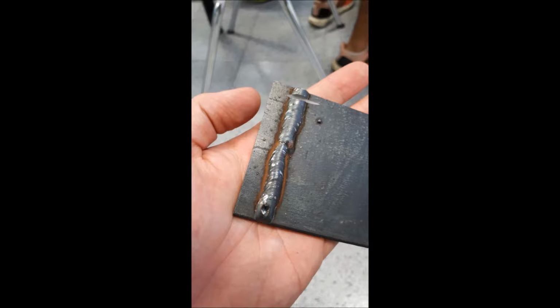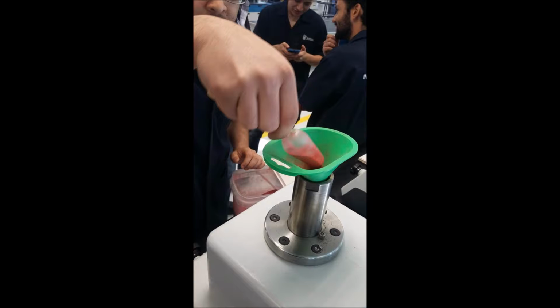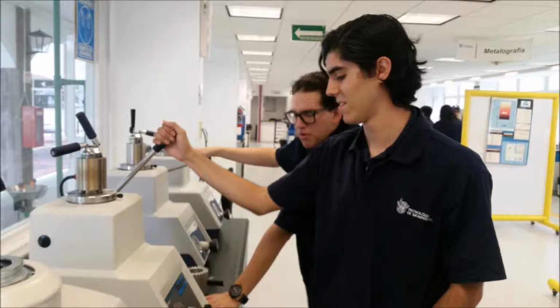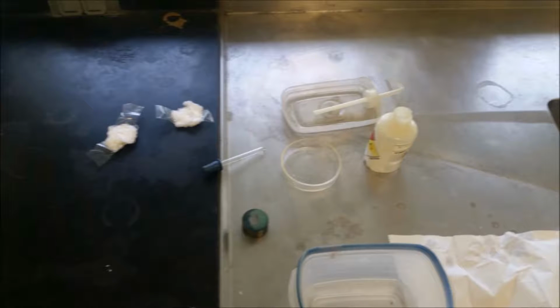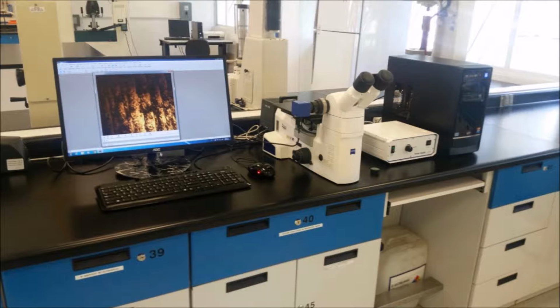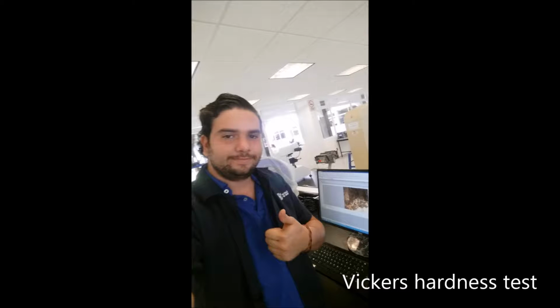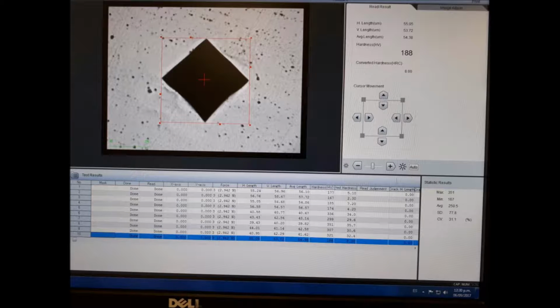First, we must weld a uniform bead with two plates. Then we have to cut it on the cutting machine on the welding section. And then we must prepare a bakelite on metallographic preparation. After that, we can analyze it with a micro hardness test of Vickers through different areas. Then we obtain the photomicrographs and the main zones and subzones of the welding.